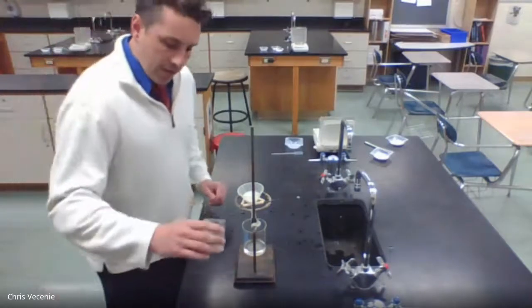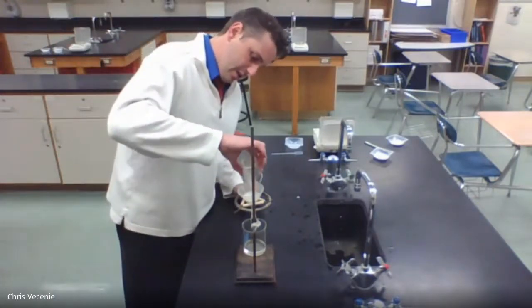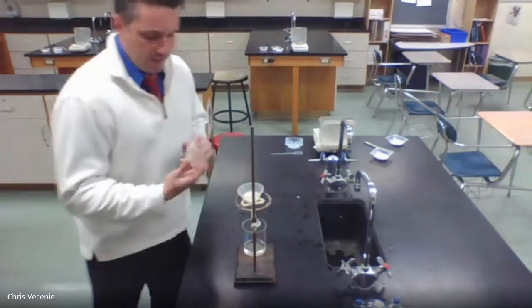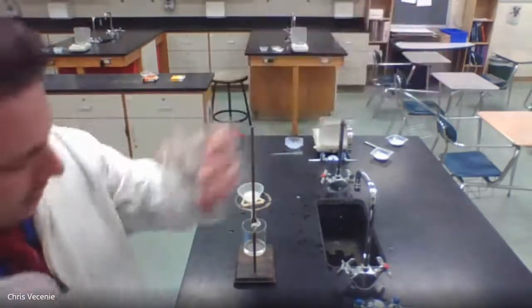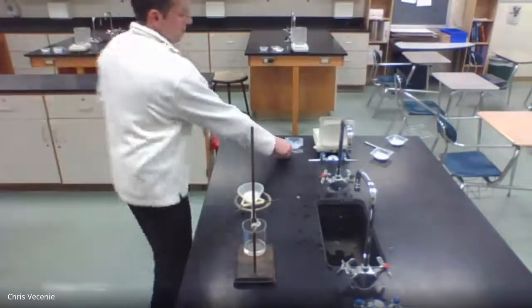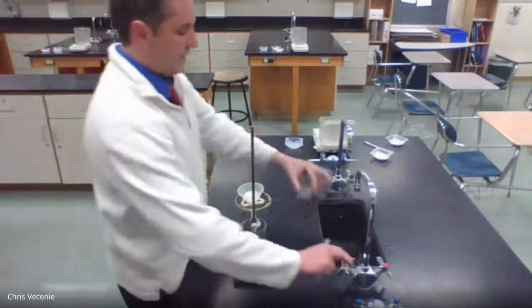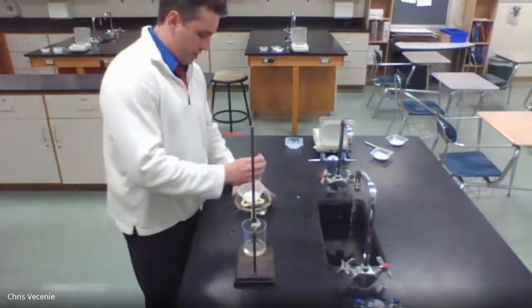It's really down to the last of it here. Pouring that in. Trying to get as much of that solid in. But like I said, inevitably, you get a little coating that we're going to use a pipette to help rinse down the side. So the 40 mils isn't the whole story.